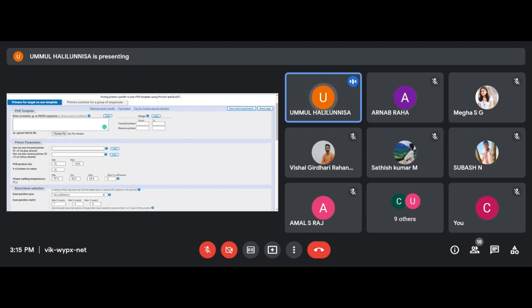It should not be 19, because while generating, one primer will be left alone, so it will not bind with your original sequence. It should be paired with each other. If you choose 20 base pairs, it's fine, and 18 is fine. Don't go for 19 or 21 or 23. Try to avoid those odd numbers.